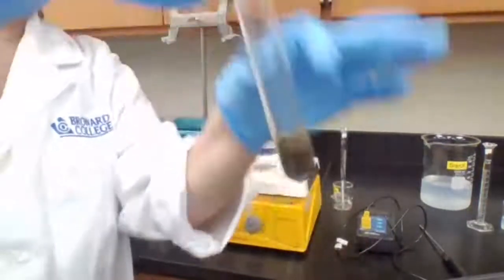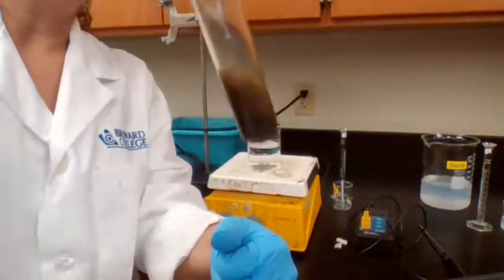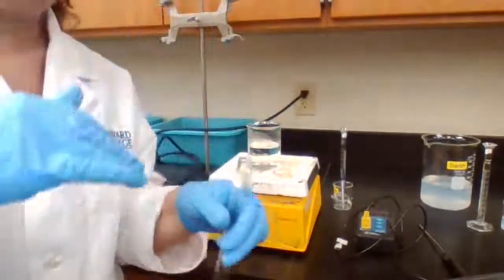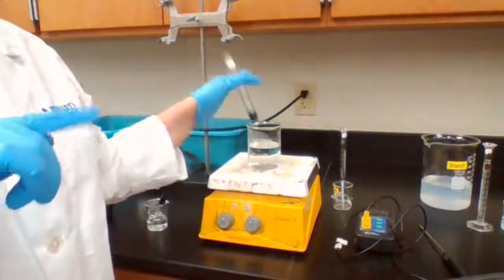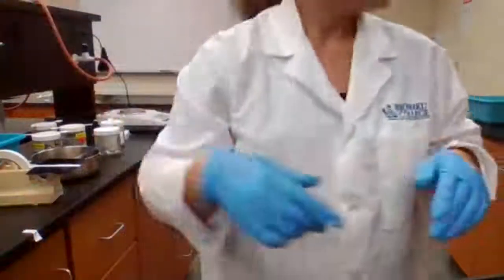So it changed to black color. Now, if you want, you can replay the video and time it yourself to see how long it took for the first reaction, how long it took for the second reaction. Second one is completely done, and this was at the 40-degree water, or the temperature of the solution was 40 degree.